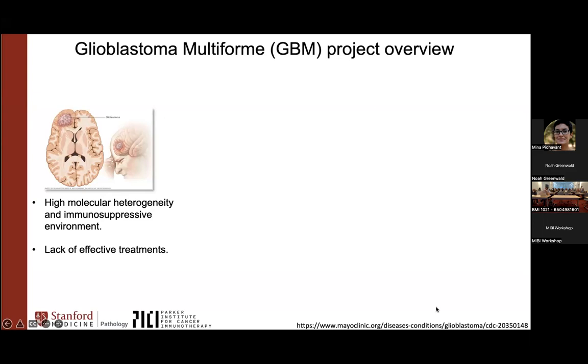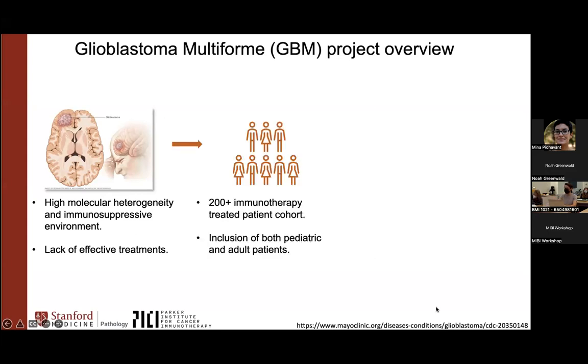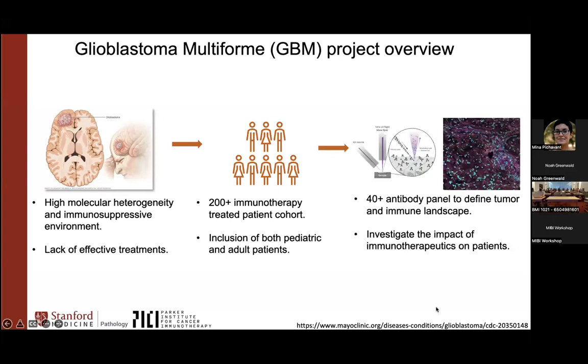And Ben and Hadeesha have really been spearheading a great project in collaboration with many other people looking at this disease to gain better insights into what's going on. This is a large cohort with hundreds of patients that have been treated with a range of different immunotherapies. And the goal is to basically assemble an antibody imaging panel so we can spatially profile the tumor microenvironment within the brain to understand what are the drivers of the differential response between patients across different patient groups within specific types of immunotherapies, to better understand what works and what doesn't for the patient.